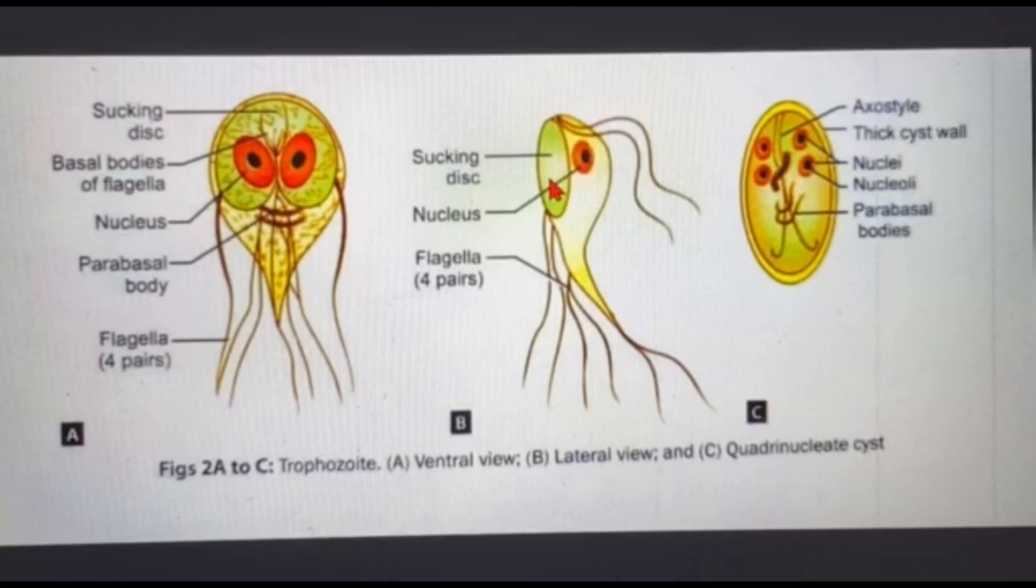The infective form, if you see, is the cyst. Now this cyst is definitely different from this scary doll, I say. The cyst is oval shaped, it has a thick cyst wall, and instead of these two big eyes, it has two pairs, that is four nuclei. A stem-like axis that you can see is the axostyle and the parabasal body which doesn't really look like a wicked smile here.